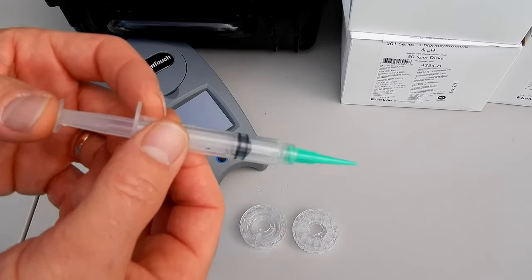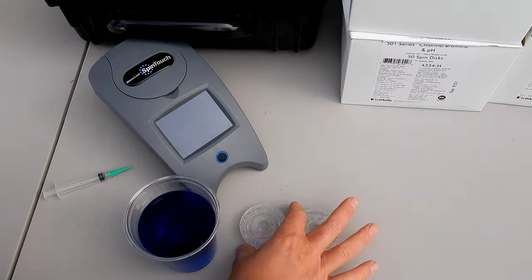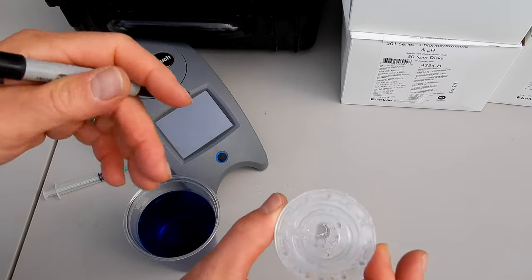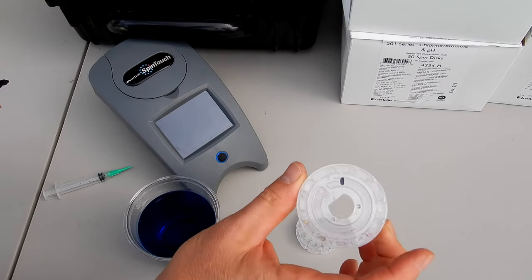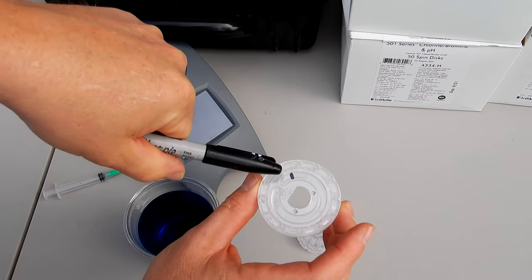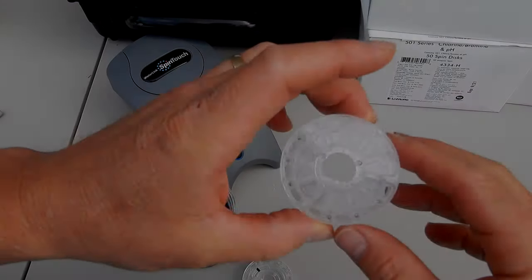The first thing you want to do is make sure the syringe has no water in it by pressing down on it. You also want to make sure you only handle the disc from the side. For this video I'm going to mark the fill line with a Sharpie so you can see it — of course you wouldn't do this when using the disc as it'll interfere with the reading, but just for the video I have that marked so you can see when it reaches the fill line.